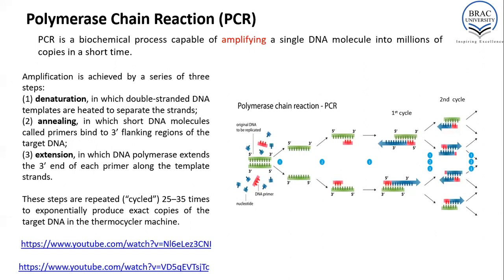PCR is involved in all of the modern processes of molecular biology. Whatever the experimental process is, PCR is involved there. This reaction is very simple to set up and also very cheap. As well as that, it is a very robust, speedy, flexible and sensitive experiment to do.